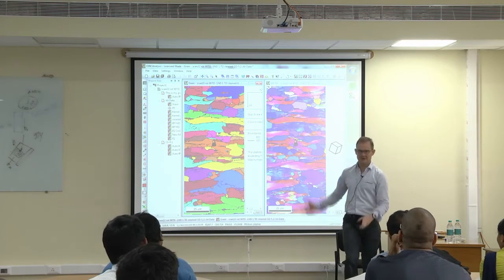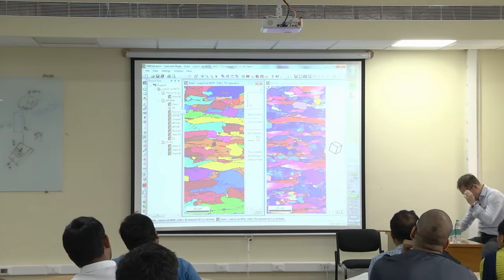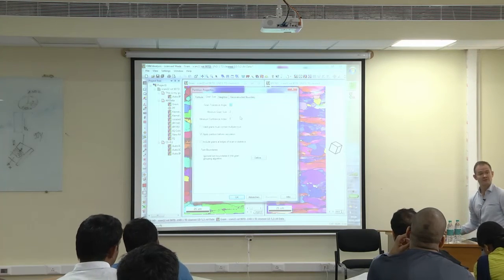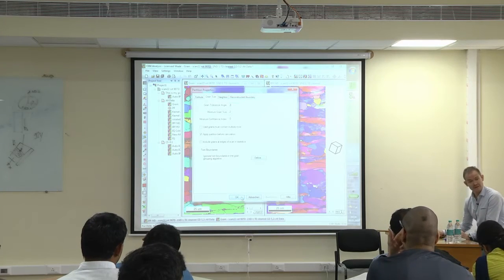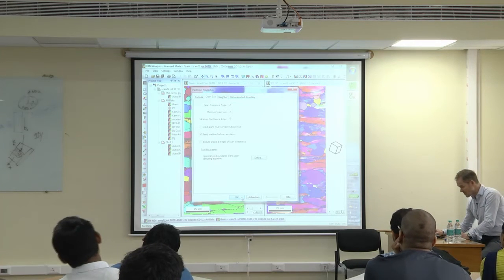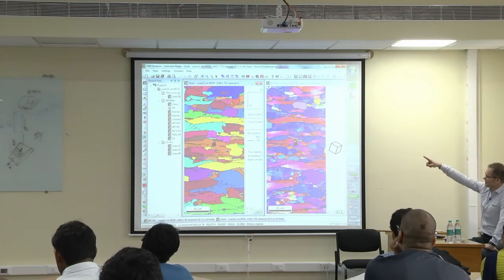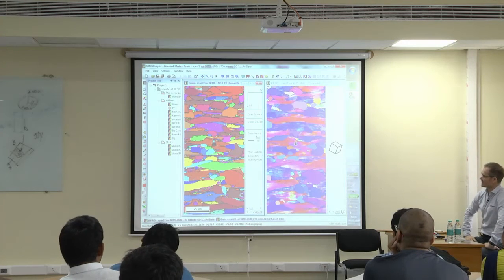We need to go for a compromise. And I could show you as well what happens when we take 2 degrees as a compromise. No, not as a compromise, as conditions. We could now look in a moment how big the misorientation is. Now I took 2 degrees, another extreme, and now you will see that this left grain will fall into many little grains. It will become many smaller ones.